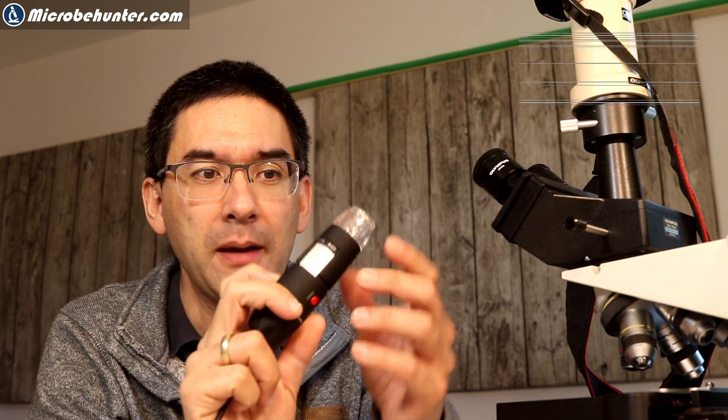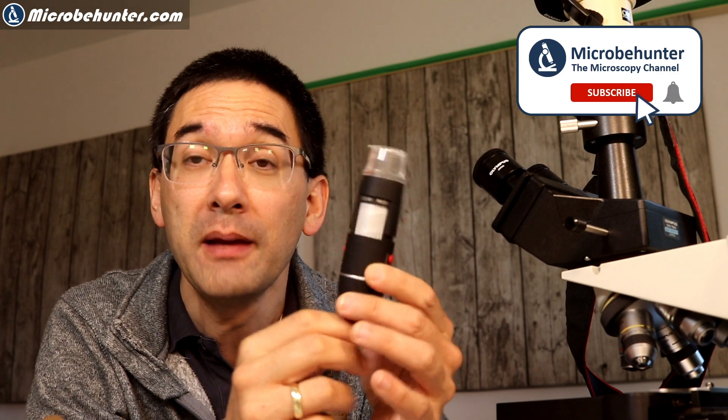Thank you very much for the question. Just to clarify, the viewer has three microscopes. One of them is a USB microscope — I've already made a few videos about this. The other one, the Vario Abresa BioLux, is an introductory microscope. And yet the other one, the Reflected Digimicroscope, is actually quite an interesting one — I've never seen something like this before. It has a completely different construction and design. So the question is: are they good for amateur microscopy?